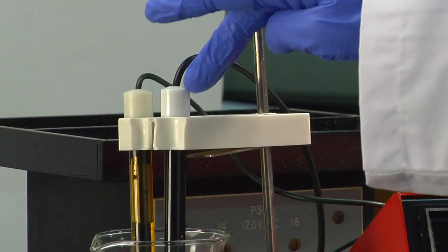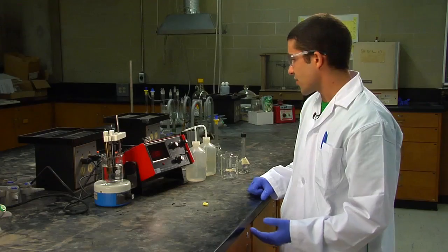And you also have your two electrodes. One is your reference electrode, and the other is the analyte-specific electrode. For this case, it's fluoride.